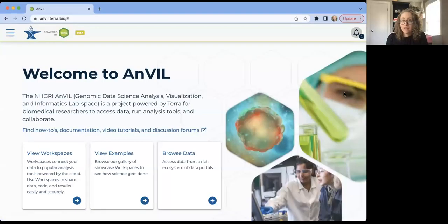As Liz said, my name is Kaylee Mathews. I use she/her pronouns. I am a senior science writer at the Broad on the user ed team, but I also work closely with the pipelines development team, as Liz mentioned. I'm just going to go ahead and share my screen.